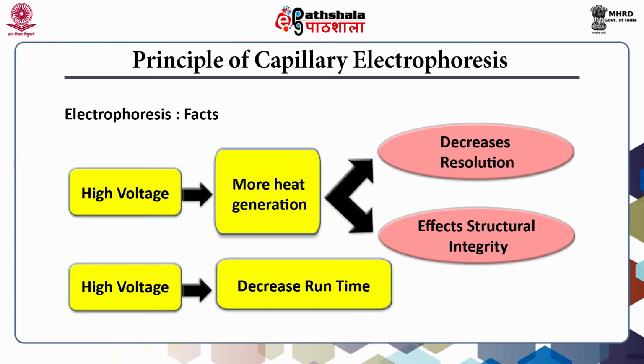Capillary gel electrophoresis differs from PAGE, SDS-PAGE, agar gel electrophoresis in the sense that high voltage can only be used in capillary gel electrophoresis. No doubt, high voltage generates more heat, but in capillary electrophoresis, generated heat is dissipated fast. This essentially is possible in capillary, where surface to volume ratio of fluid in capillary is very large. Large surface area facilitates dissipation of heat.